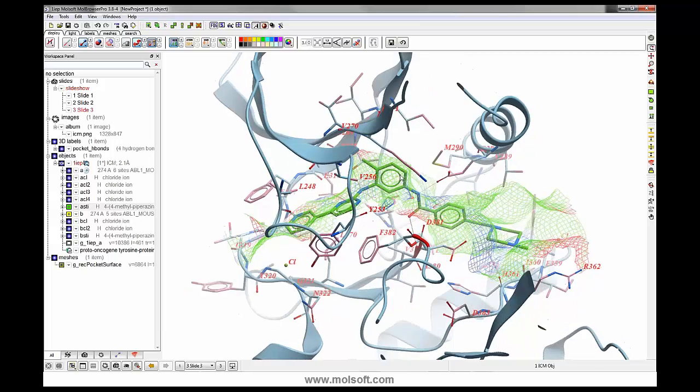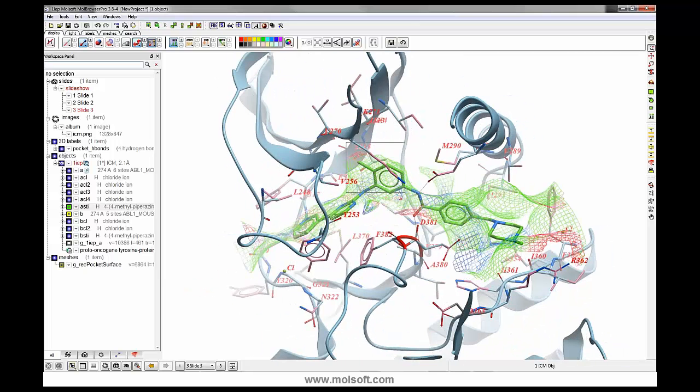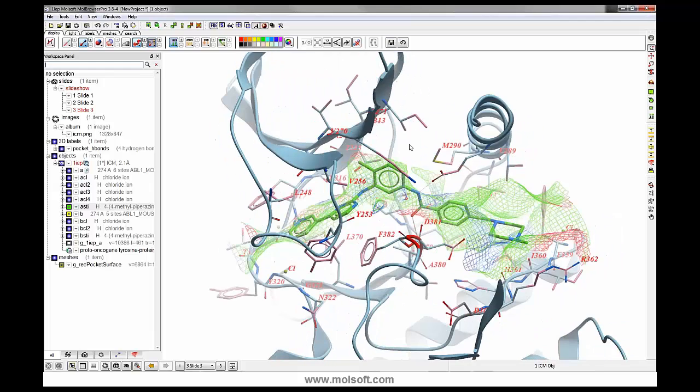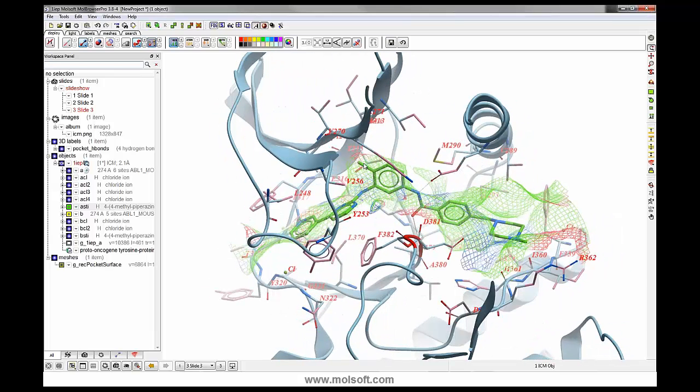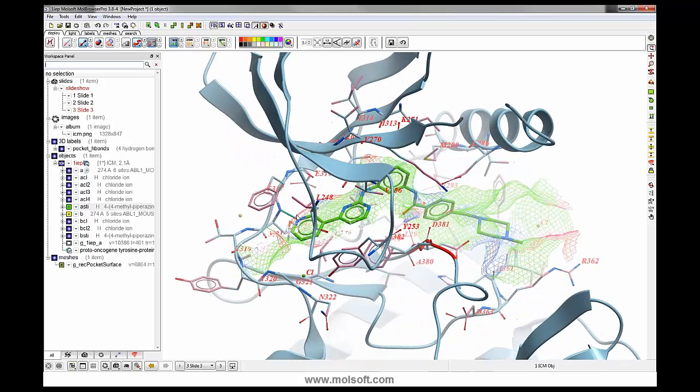So this is the pocket. You can see here that it's sort of closed off, so there's very little space there. If you're thinking about ways of modifying this ligand and you want to keep the same pose, there wouldn't be any point in trying any modification at this point here. And likewise here, obviously towards the hinge, you're sort of stuck as well.